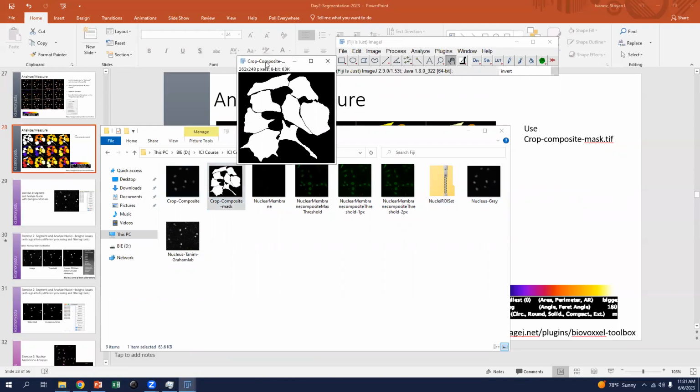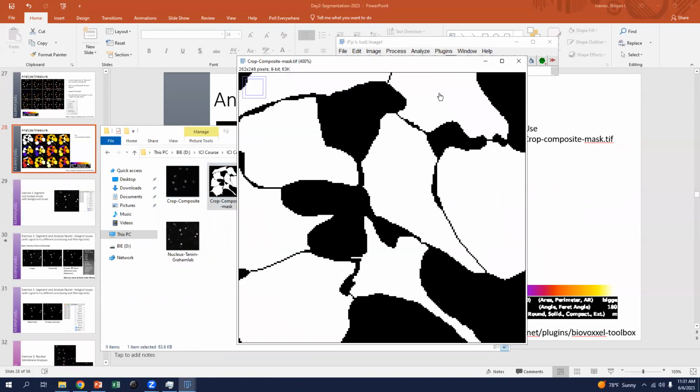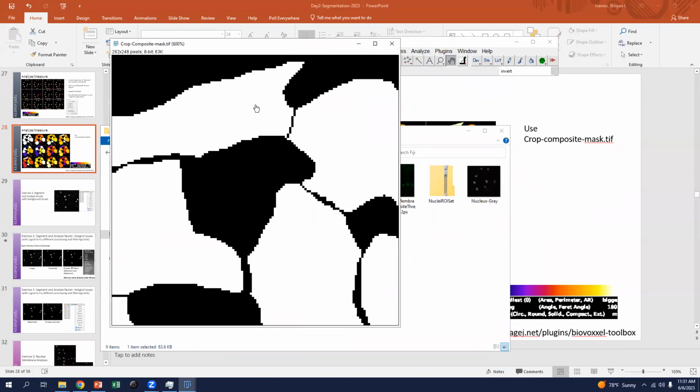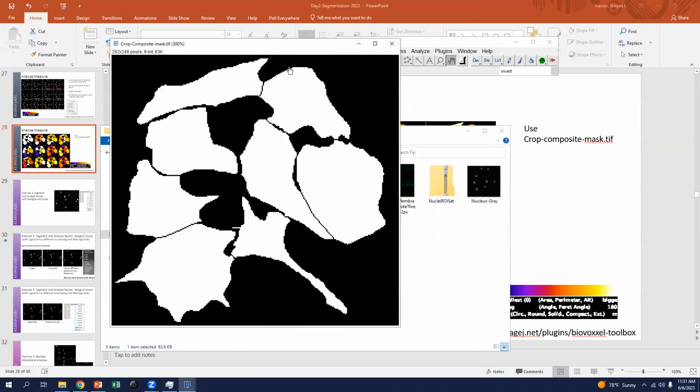When I talk about watershedding, this is the kind of structure that we've used watershedding on. Because the structures are so large and geometrically complex, the thresholding doesn't always separate them. So the watershed algorithm looks to find the barriers between the number of structures, and segment them just a little bit, just so they're not contiguous. So you can then use this as a mask somewhere else.